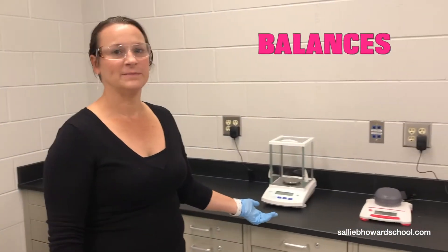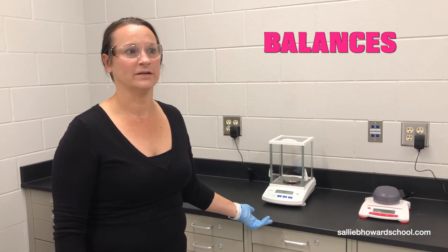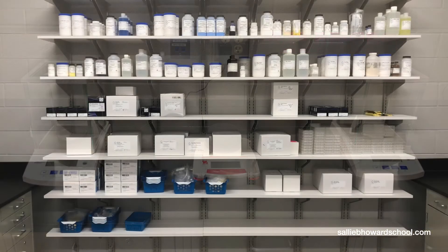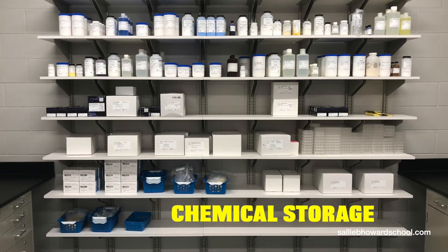In this room we have our balances. We have two different types here that students will learn the basic lab skill of weighing things out properly for their experiments. Also included in this room is our chemical storage, which you can see is very vast. Students will actually learn how to read these labels and come get their own chemicals throughout the semester, maybe in year two or even three.